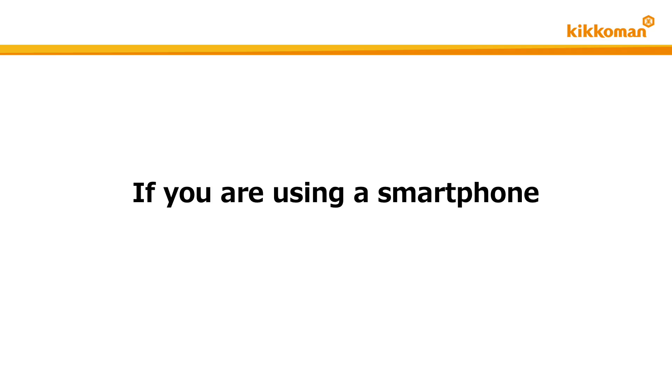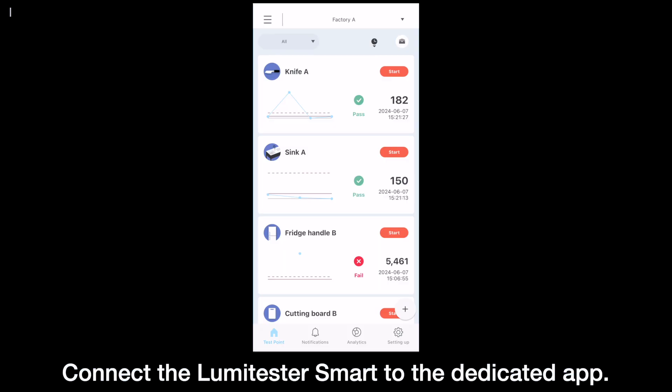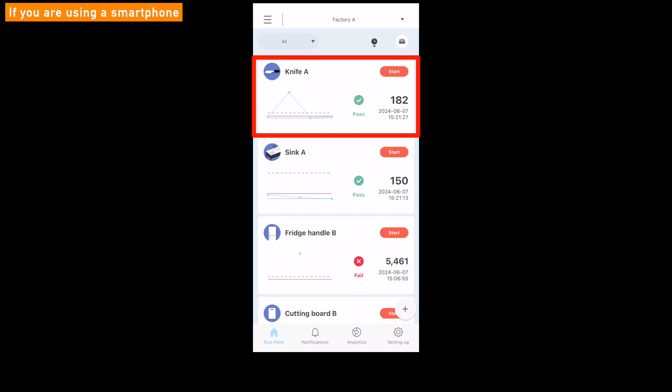From here, we will explain the test method when using a smartphone. First, connect the Lumetester smart to the app and select a test point group. This time, we select Factory A. Next, select a test point, for example, Knife A.